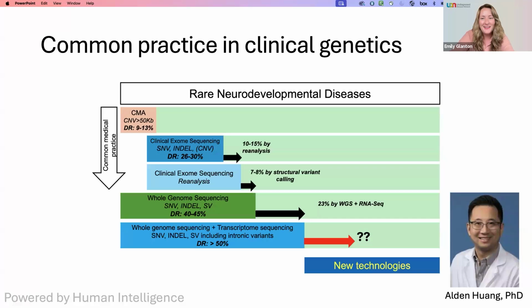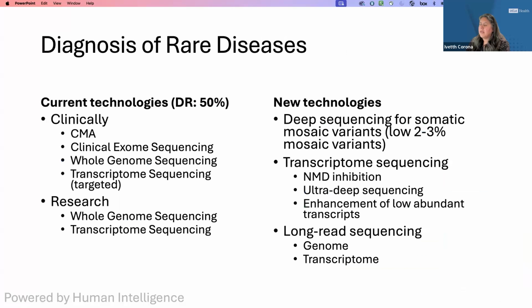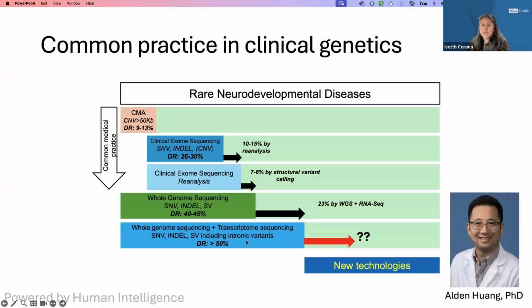All right. And then also related, in general, to recommendations. You've talked about the importance of sequencing additional controls, and this person is wondering if you have any recommendations in the choice of samples, given that most cases are genome negative. Yes, my recommendation is that you select maybe a group of cases, potentially.